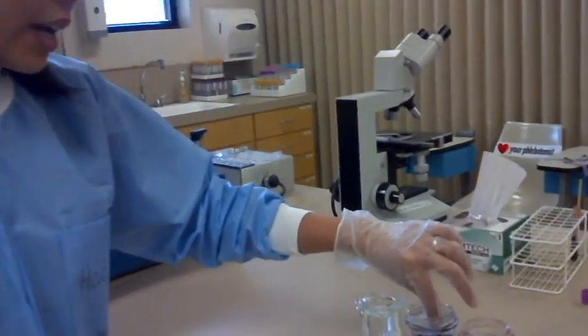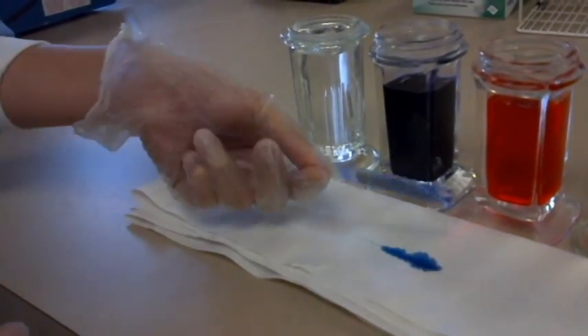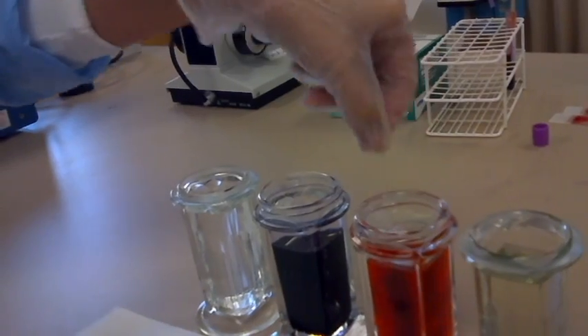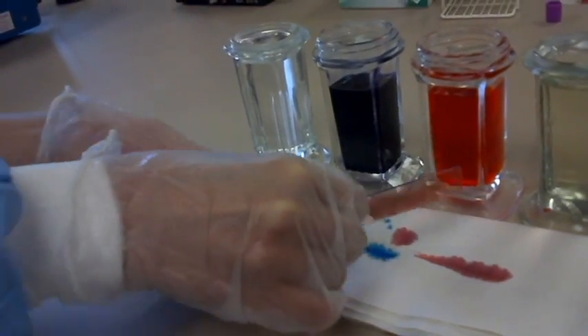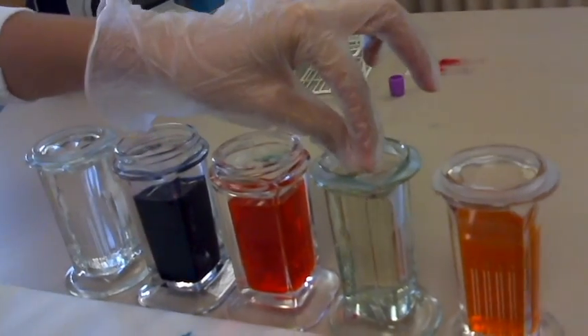After 1 minute, I take out my smear, tap on both sides, and then put it in eosin for 1 minute. Eosin is acidic, so the basic structures of the cell will take up the eosin dye. After 1 minute, I take out my smear, tap on both sides again, and then dip it in water 4–5 times.